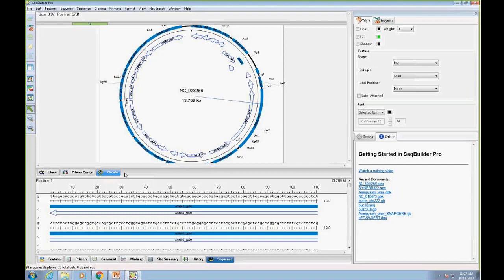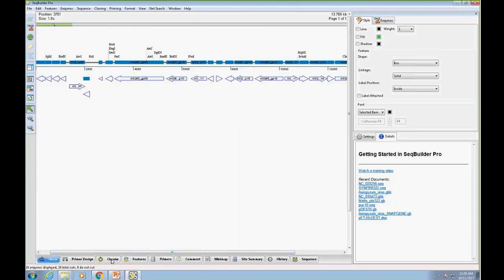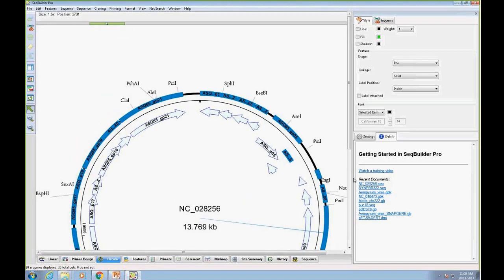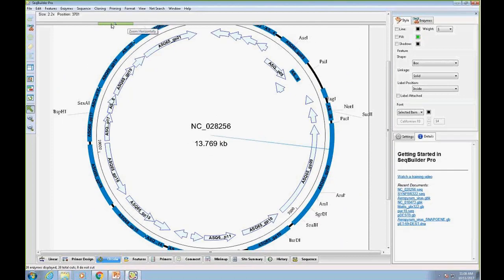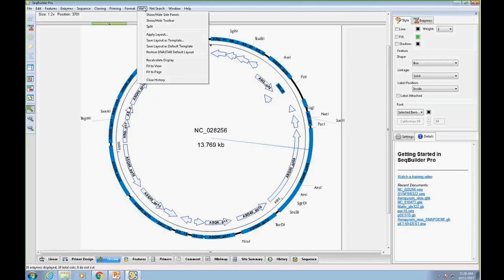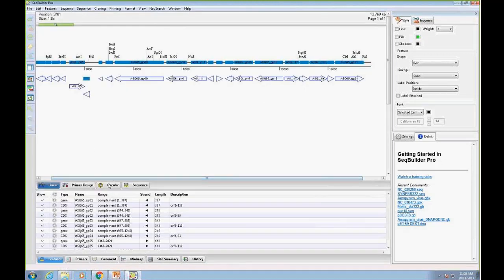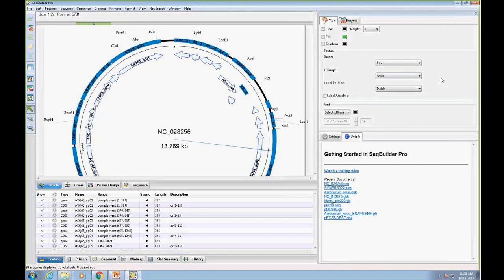You can also merge all buttons to a single window if you just want one large view — for example, a very large circular map where you can zoom in and out using most of your screen. On the far right there's also a new side panel with four tabs: style, enzyme picker, settings, and details.